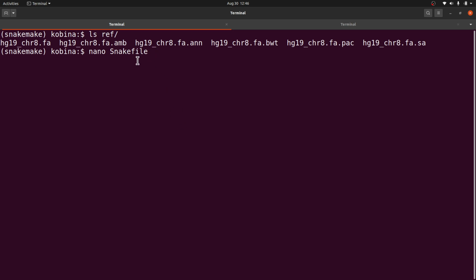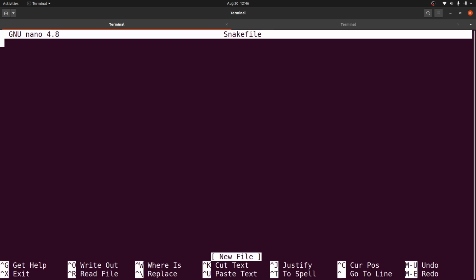But if you use a different name, you have to specify it when you are calling Snakemake. So this one simplifies it for you by not specifying it. So let's all use this one, and later you can make changes. So we'll open it now. Okay, I've opened it. In Snakemake, activities that are supposed to be executed, you put them as rules.